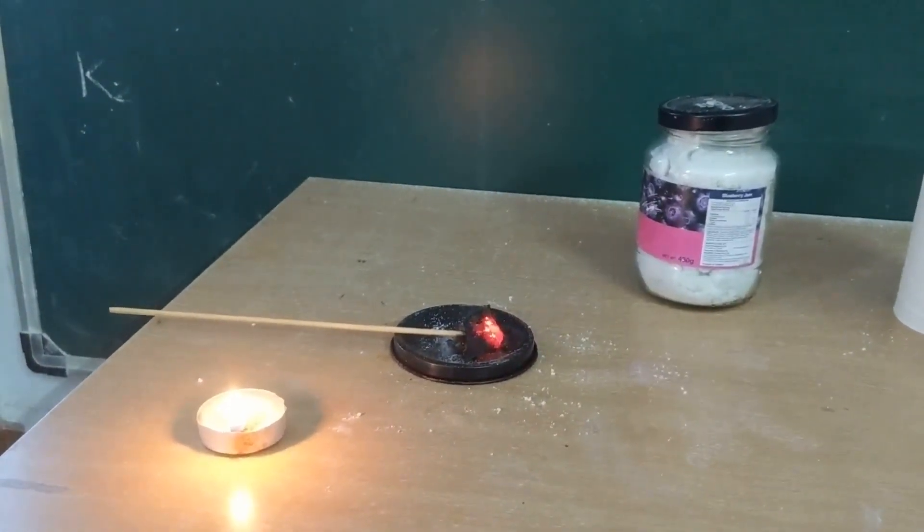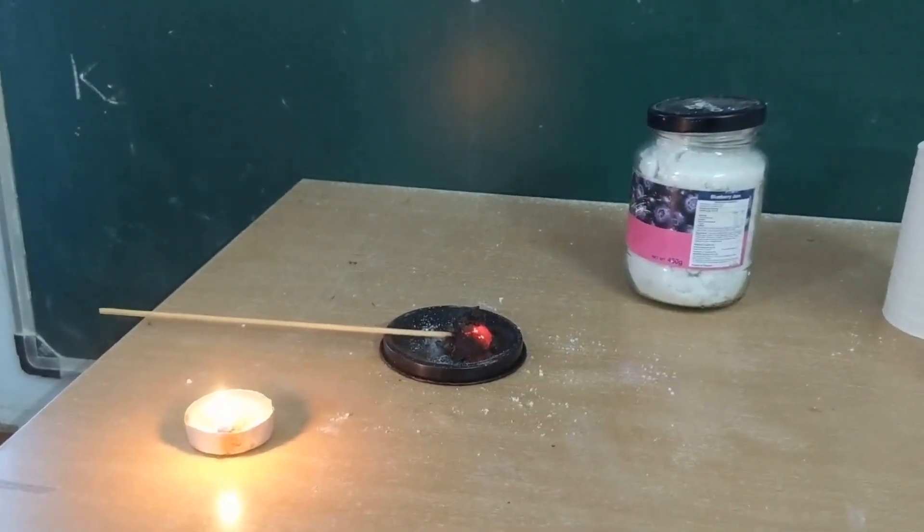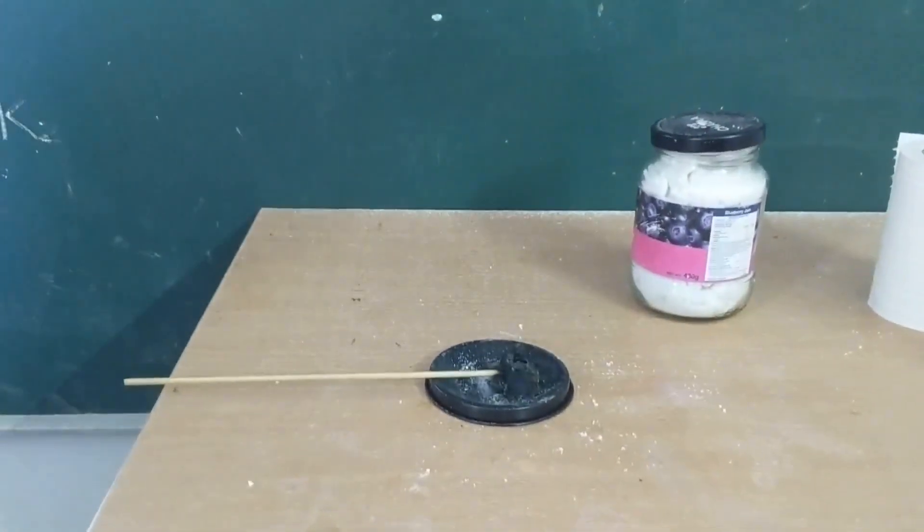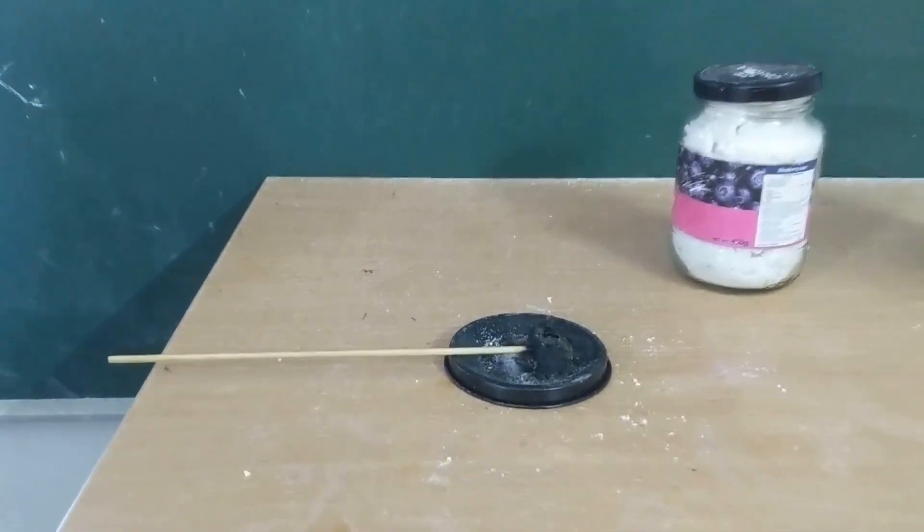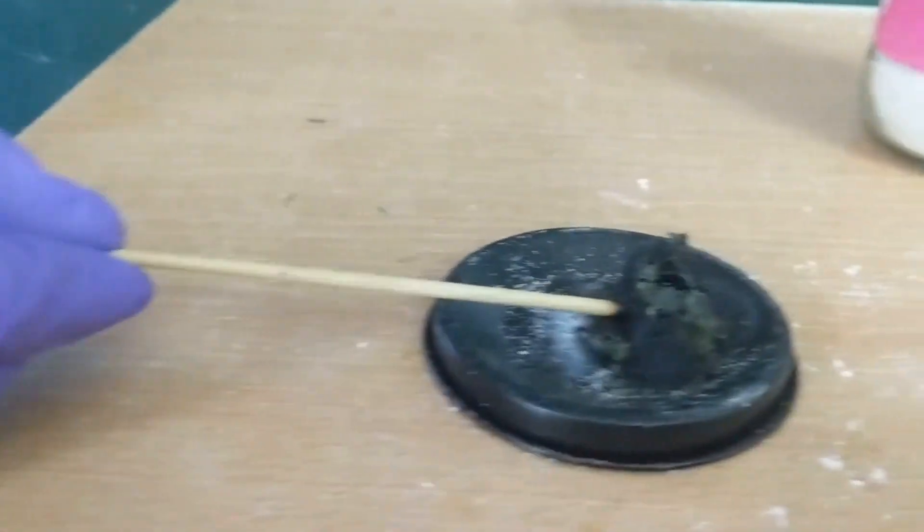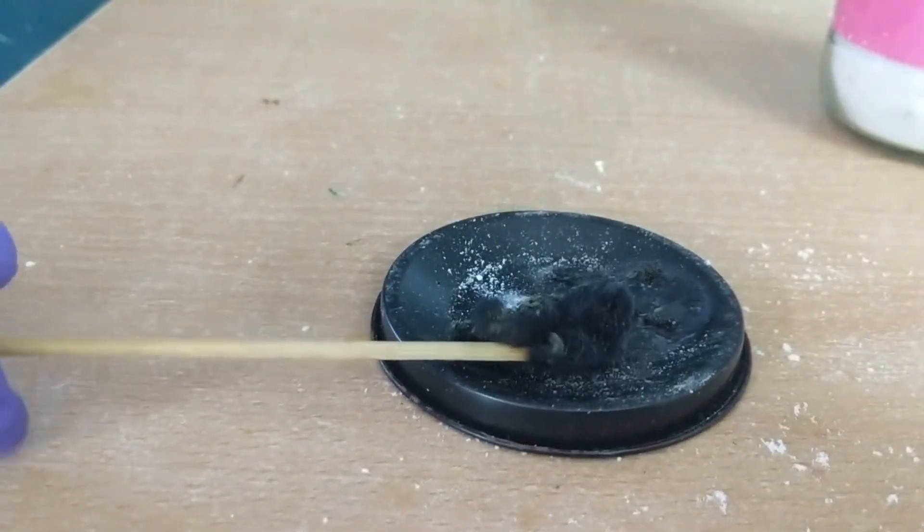Let the mixture cool back down to room temperature before you proceed. If you noticed, the flame was a brilliant purple due to potassium ions. Now the product that is formed can then be harvested and placed in a vial.